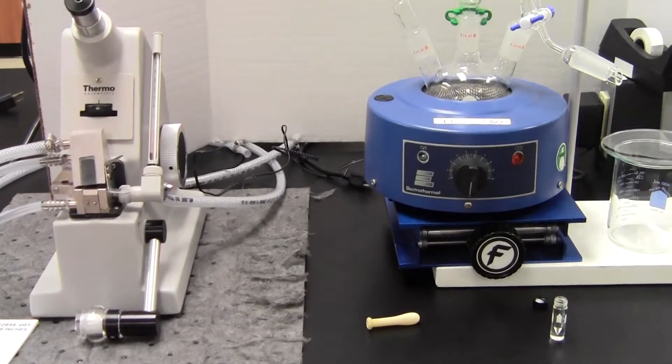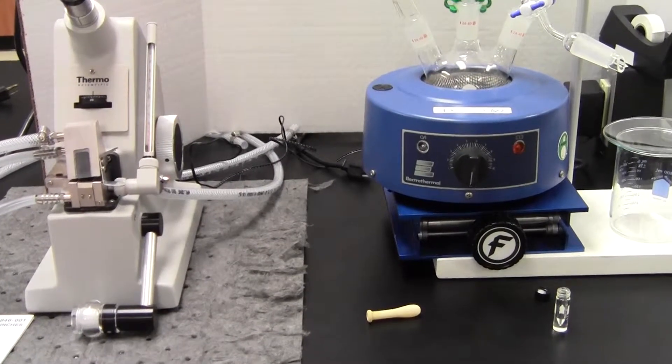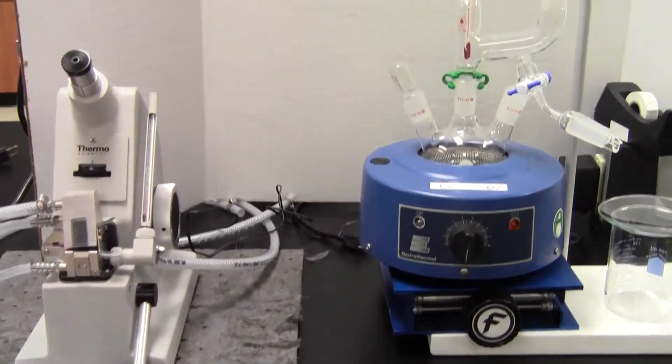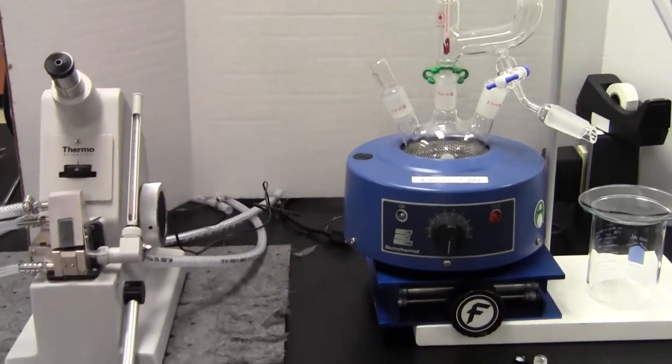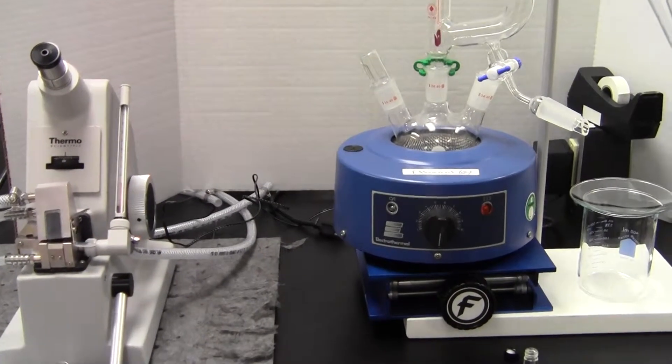Essentially now, your data is two mole fractions for every boiling point temperature, and that's why you'll have the shape of the plot that you see in your manual. Your TAs and instructor will tell you more about that.